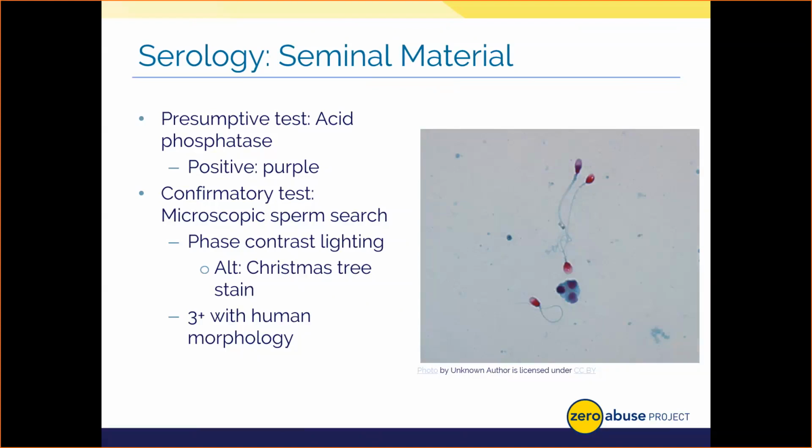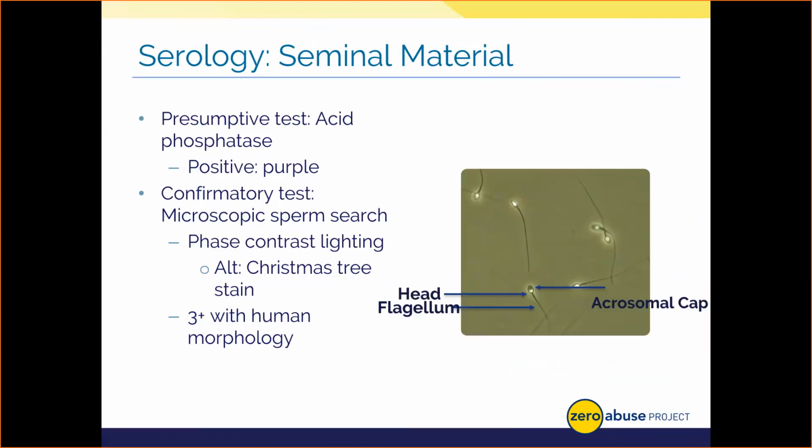We have two differentiating or color contrasting stains, a red and a green one. And the green stain will actually bind to any cellular components without DNA, like the tail or flagellum of the sperm. Now, the red stain binds to the part with DNA, that head and that acrosomal cap you can see, and I'll show you that in a minute. So what we end up getting is this red head and green body of the sperm that we can use for visualization. Let's go ahead and get back to those phase contrast results then.